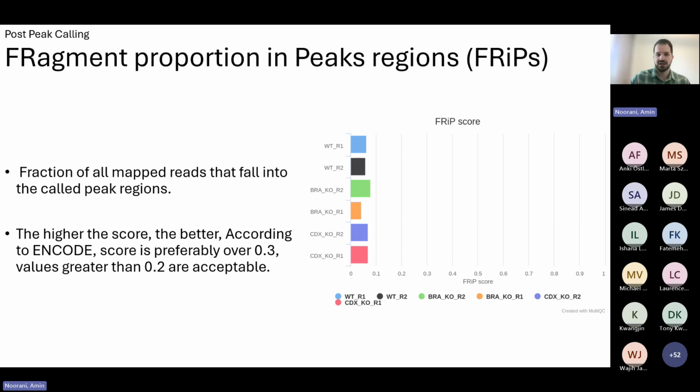So you have to be careful when you're judging your quality based on all these metrics. Some of them are obvious. Some of them are from raw data, where you didn't do anything. But in this step, you applied so many tools to your data. So it's important to know what happened before that data is generated. It's not like I see a score is low, then call it a day. Of course, it's not that easy.